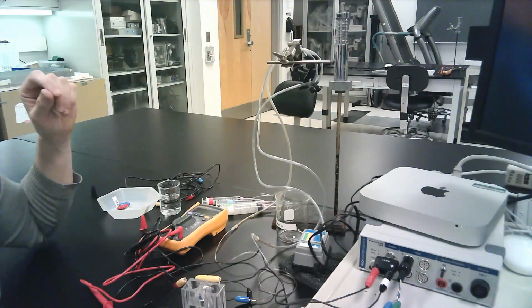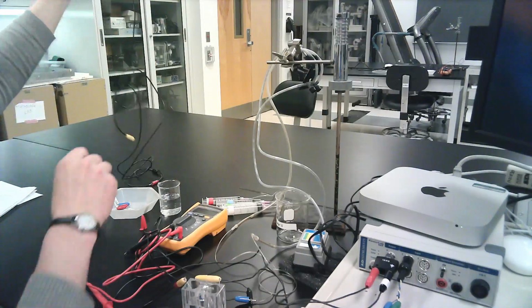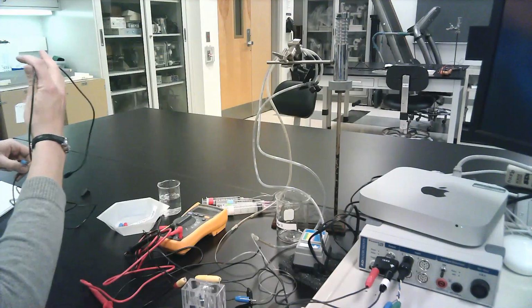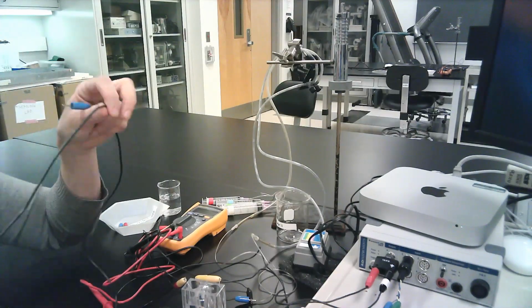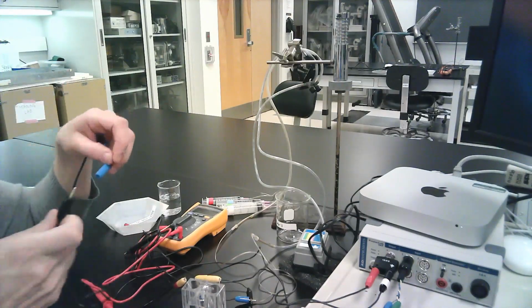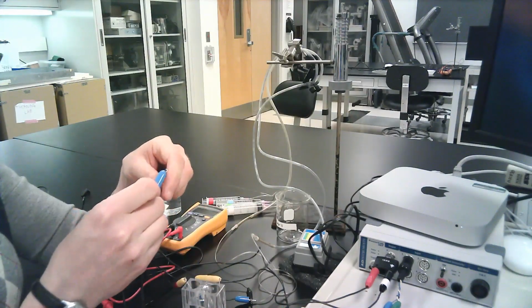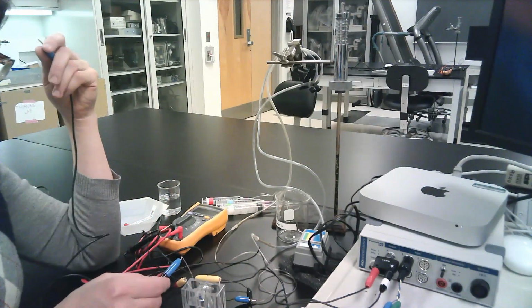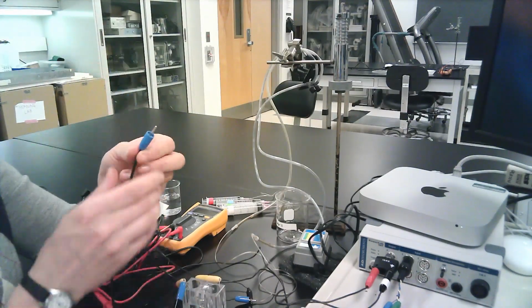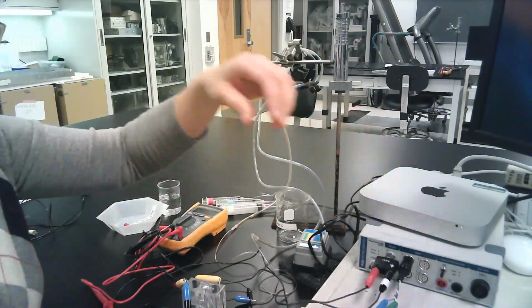Okay. And then I'm going to take a cord here that has a black end and a blue end. With the black end, I'm going to plug into a blue electrode, making sure that I line that electrode up on the correct side of the chamber. And then the other blue end will plug into the blue connection to the Power Lab.